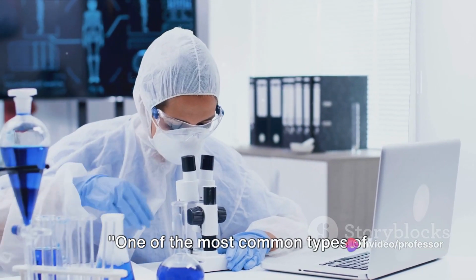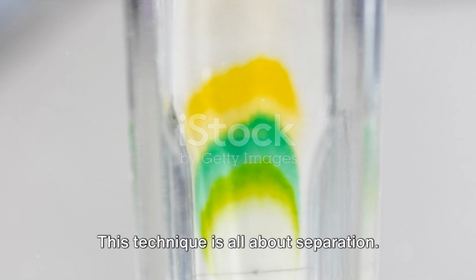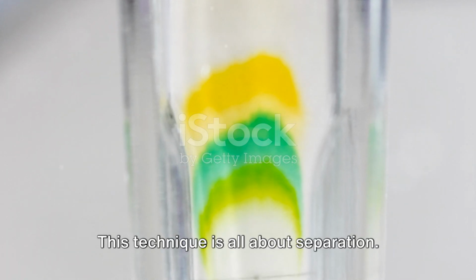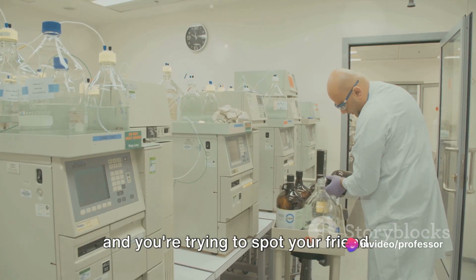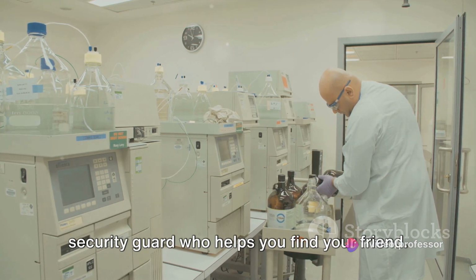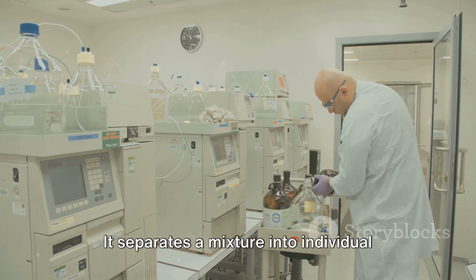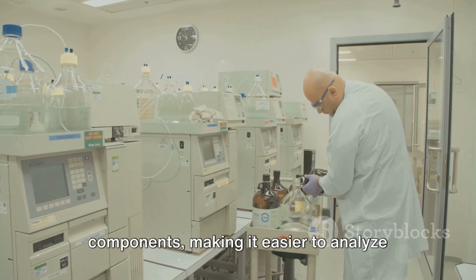One of the most common types of chromatography is column chromatography. This technique is all about separation. Imagine a bustling crowd at a concert and you're trying to spot your friend. Well, column chromatography is like the security guard who helps you find your friend. It separates a mixture into individual components, making it easier to analyze each one.